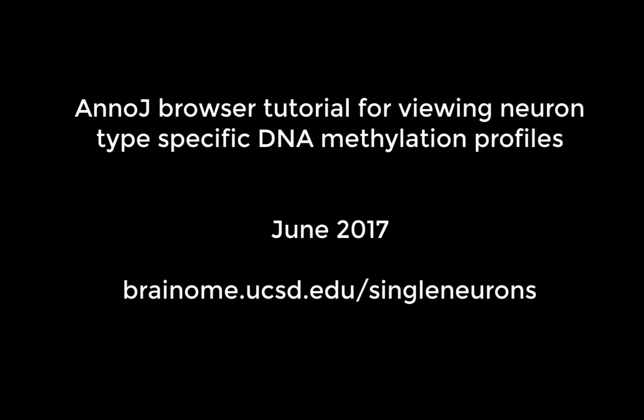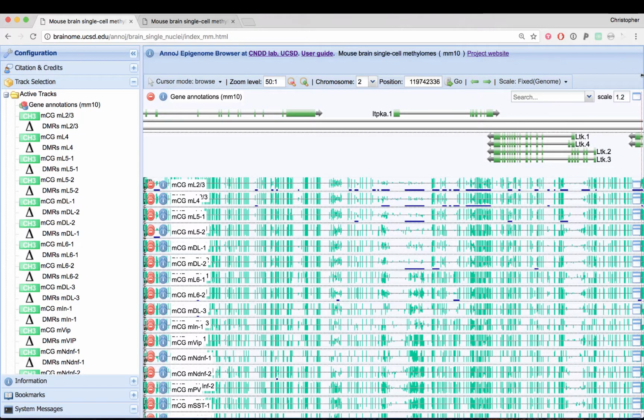Hello, and welcome to our tutorial on how to use the AnnoJ browser to view neuron type-specific DNA methylation profiles as generated using whole genome bisulfite sequencing. So when you come to the browser, you're probably interested in a particular gene. Let's say, for example, you're interested in the inhibitory marker GAD1.